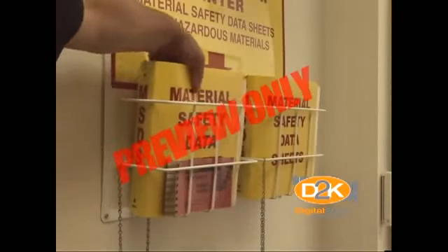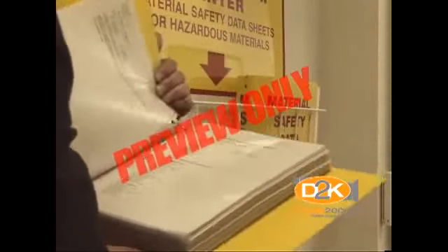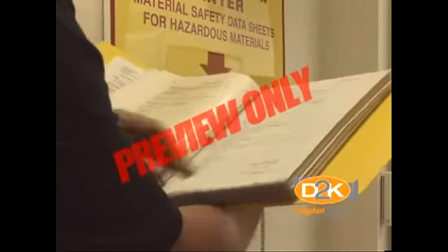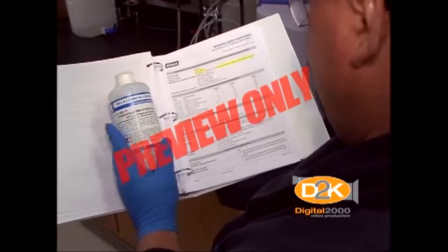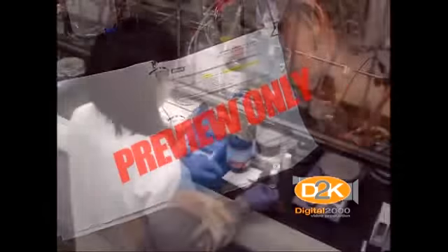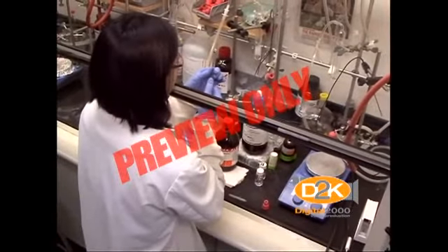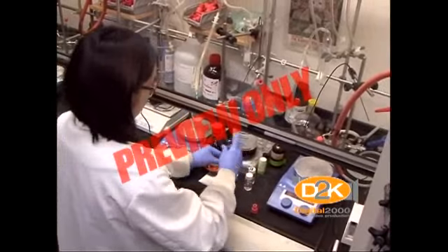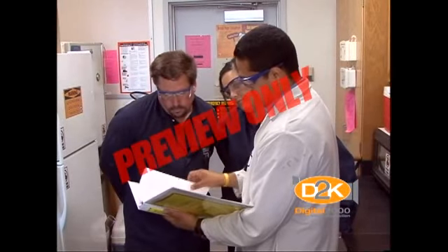The Material Safety Data Sheet, commonly called the MSDS, is a component of your university's chemical hygiene plan and hazard communication program. The MSDS contains information provided by the chemical manufacturer and is maintained by the university to inform students and staff of the possible hazards associated with chemicals being used in their laboratory or work area. It is a critical part of any laboratory safety program.